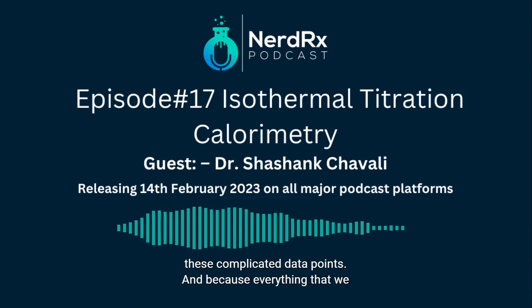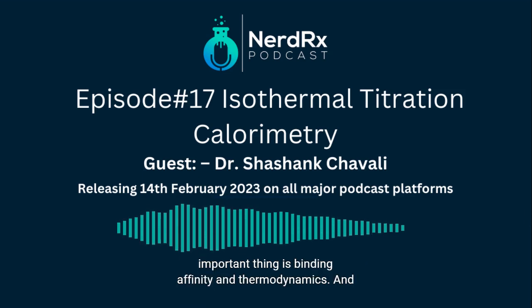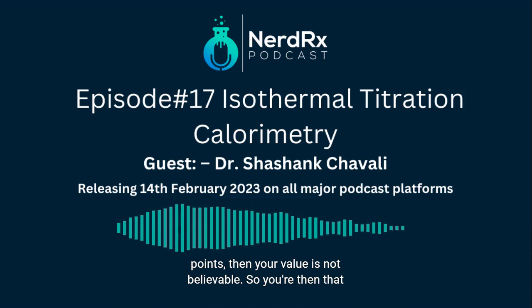Everything that we take out from an ITC experiment, the most important thing being binding affinity and thermodynamics, is heavily dependent on how good your fit of the data is. And if your fit is noisy, if it doesn't cover all the points, then your value is not believable.